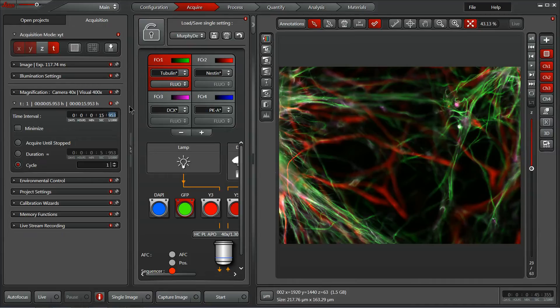I like nice round numbers, so let's get rid of that. You can also click the minimize button here, which will ignore any time interval and go as quickly as your hardware and exposure times will allow the system to go.